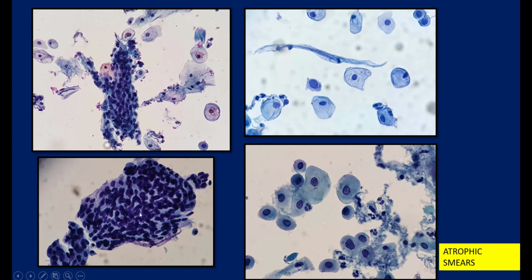and I have seen a number of times that there is sometimes a kind of deranged polarity, but what helps me is that this reminds me of some kind of mesenchymal fragment. They're not mesenchymal cells, but you see spindle cells which are enmeshed in a kind of matrix. So this is an appearance which we see in atrophic smears. Some of the cells look very spindly, with a very smudgy kind of chromatin.